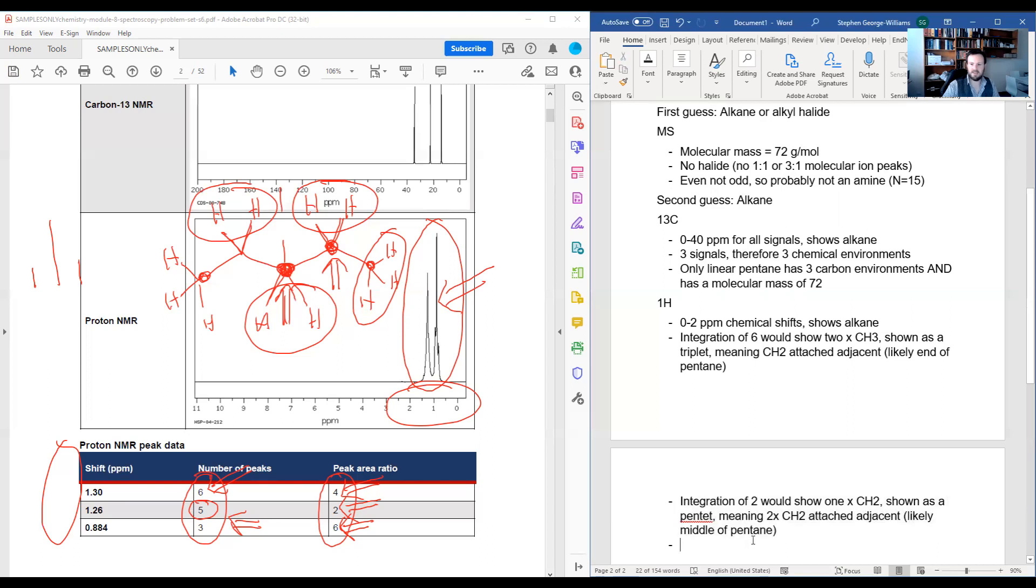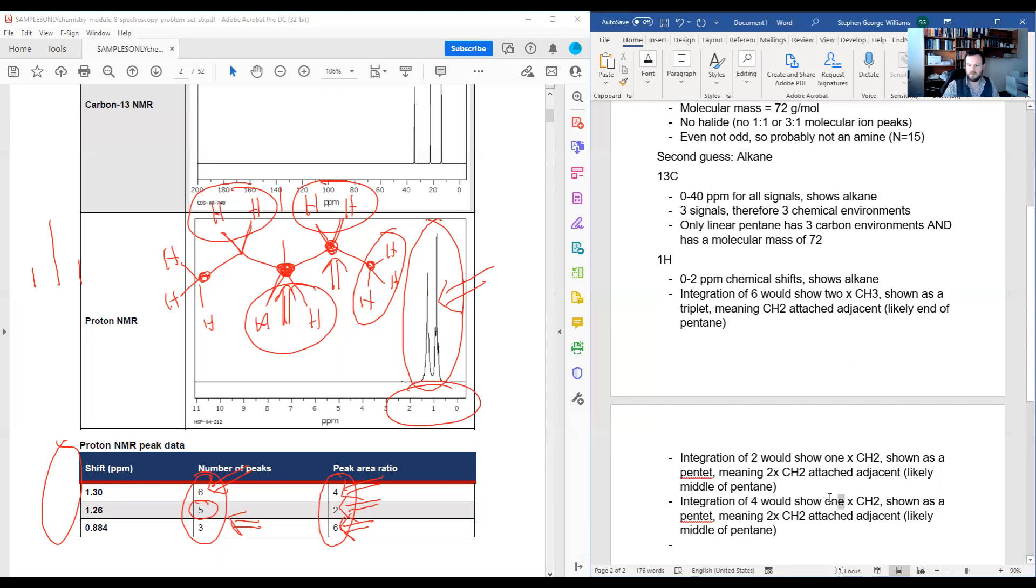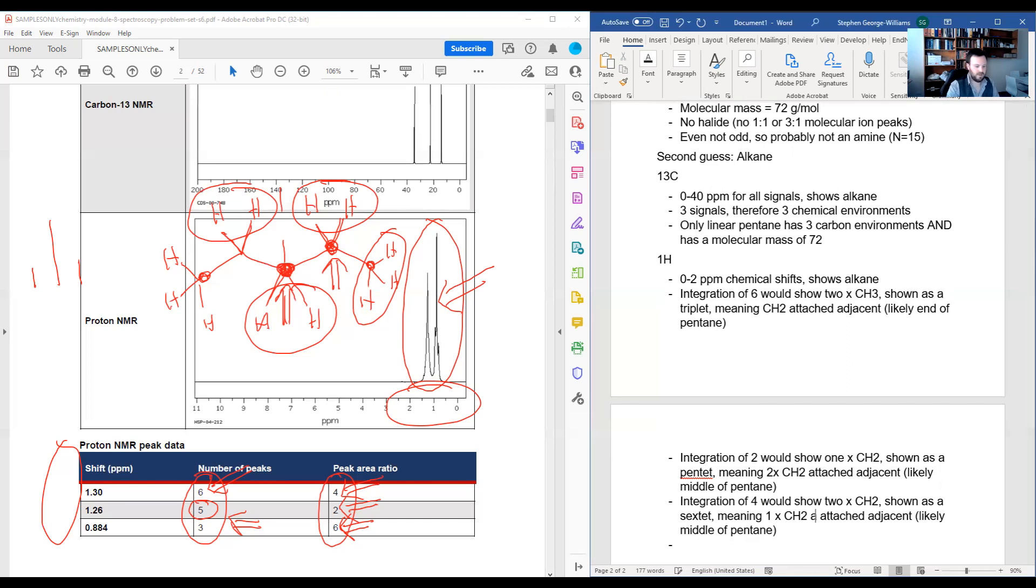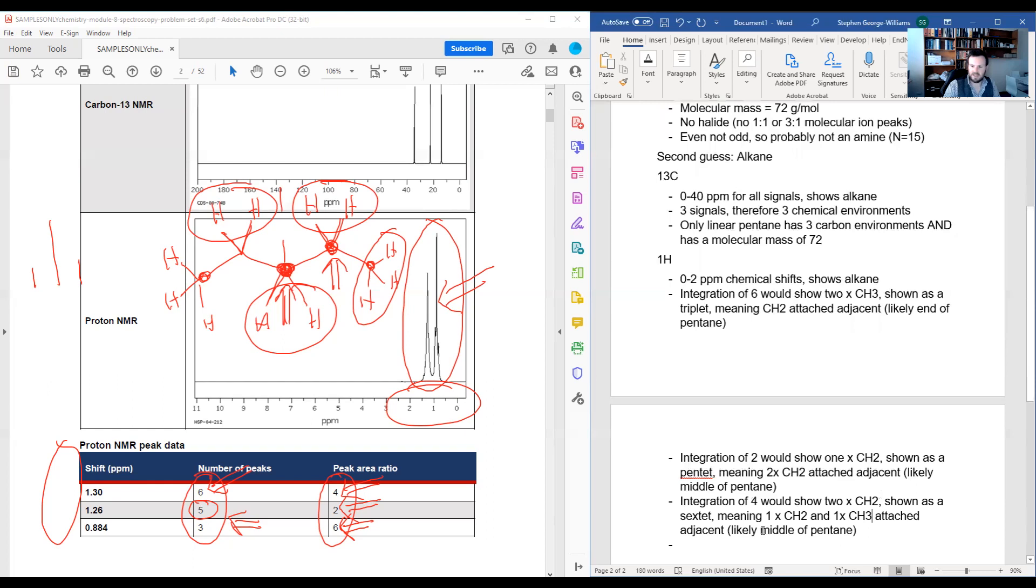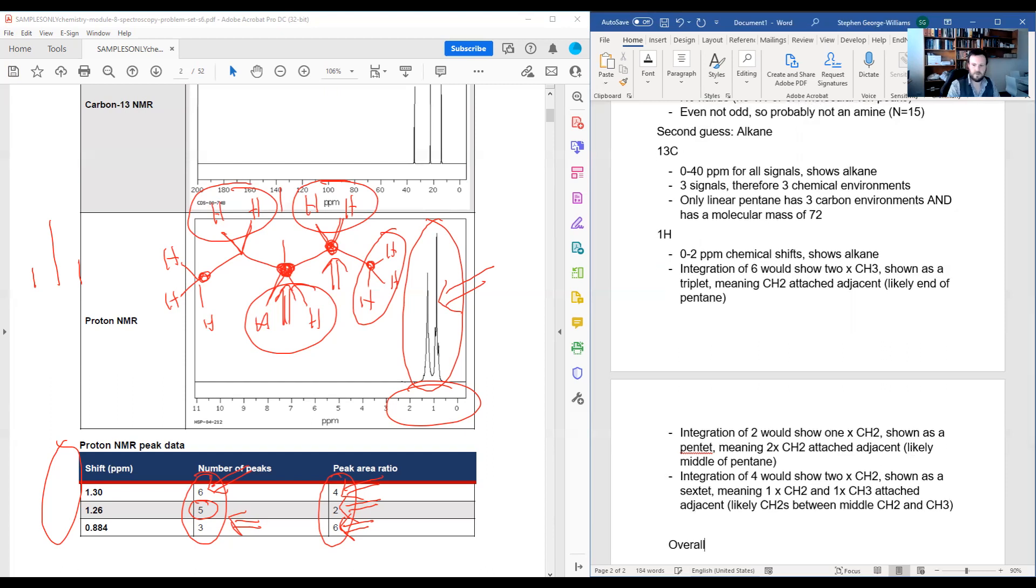Lucky last, we have an integration of four. So we're back to looking at two different systems. We have two times CH2s shown as, in this case, a sextet, meaning one times CH2 and one times CH3 attached adjacent. Likely middle CH2s between middle CH2 and CH3. Of course, you could just draw this out and point to things that you wanted to explain. But overall you have pentane.